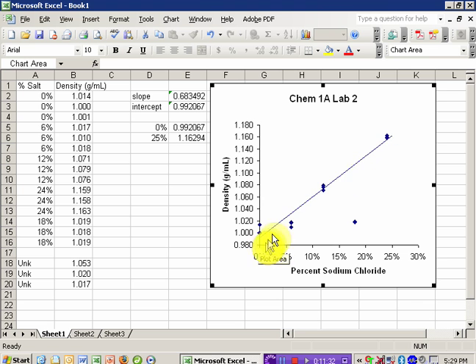And OK. And so now what I've done is my fit has no data points. It's just a line about what the best fit is. Okay. And the data has no lines. It just has data points. And now this is a pretty good fit of my experimental data.